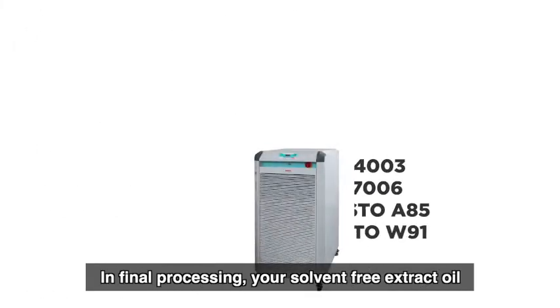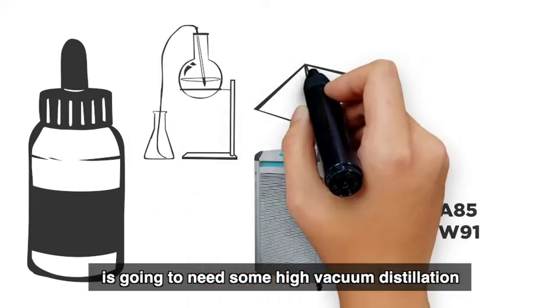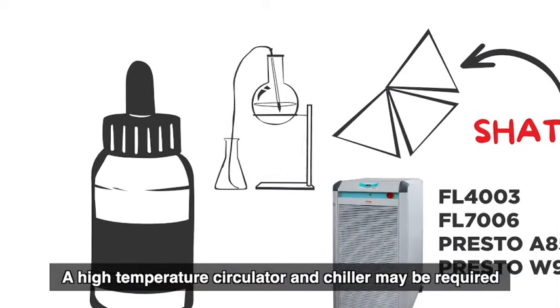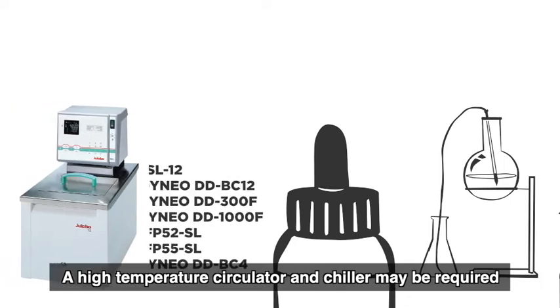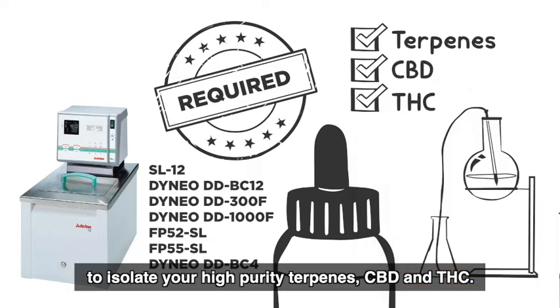In final processing, your solvent-free extract oil is going to need some high vacuum distillation if it's not shatter you're looking for. A high temperature circulator and chiller may be required to isolate your high purity terpenes, CBD, and THC.